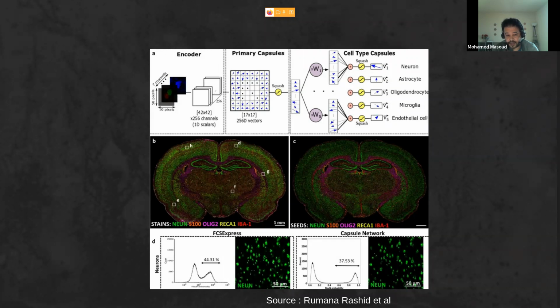There is a signal here that should be indicated as showing that this cell shouldn't be classified like an astrocyte, for example. But because there is an overlap here between what can be true positive or not, this overlapping affects the final results.